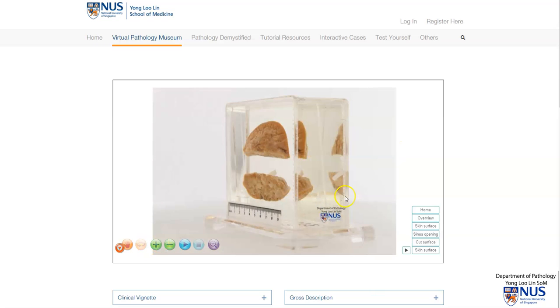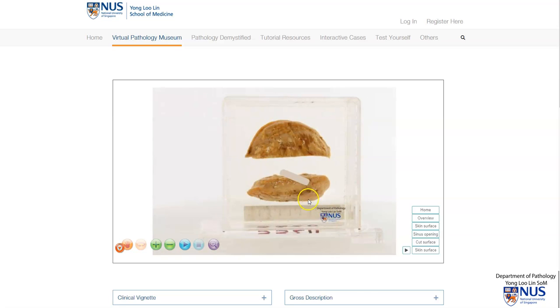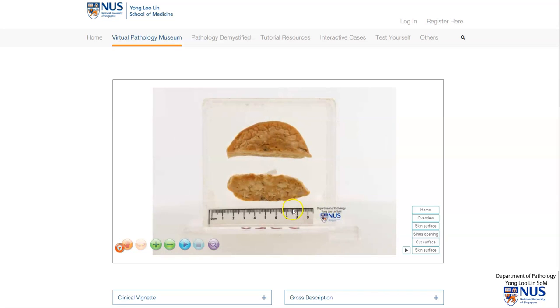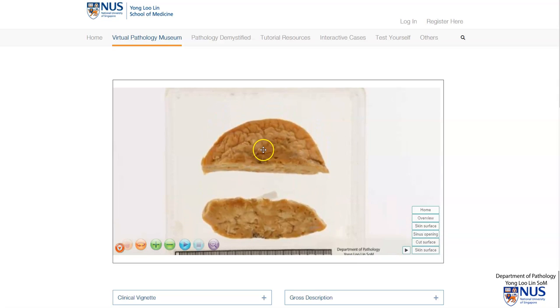Turning this around — this is the deep surface of the skin. This is still the cut surface.